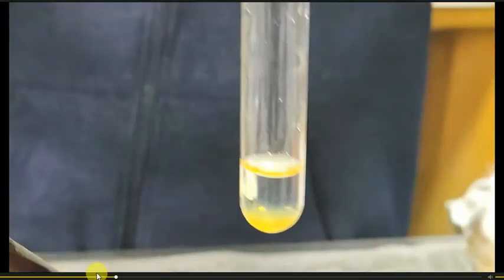I told you that the PPT will be brown or yellow. This is basically yellowish in color. This may be brown, this may be yellow. It can be regarded as brownish yellow.